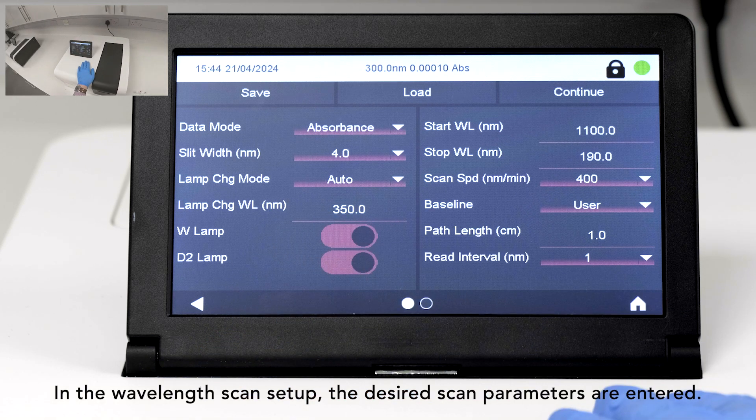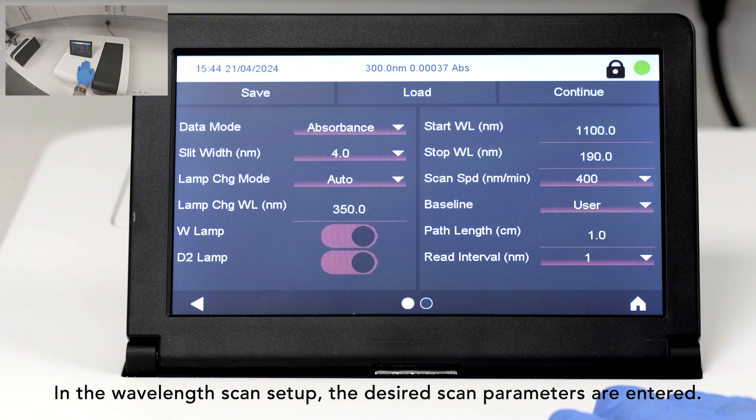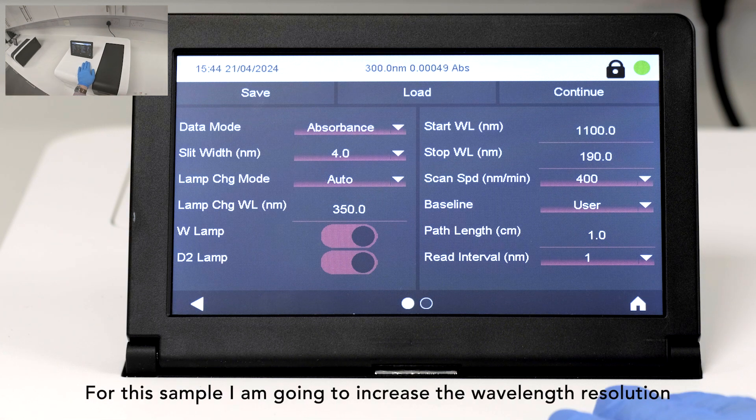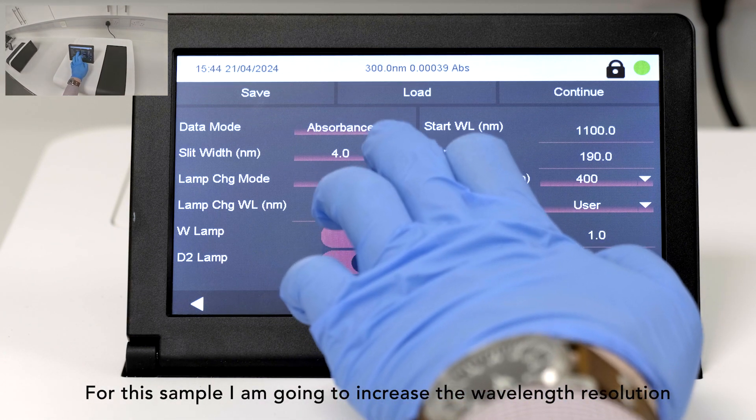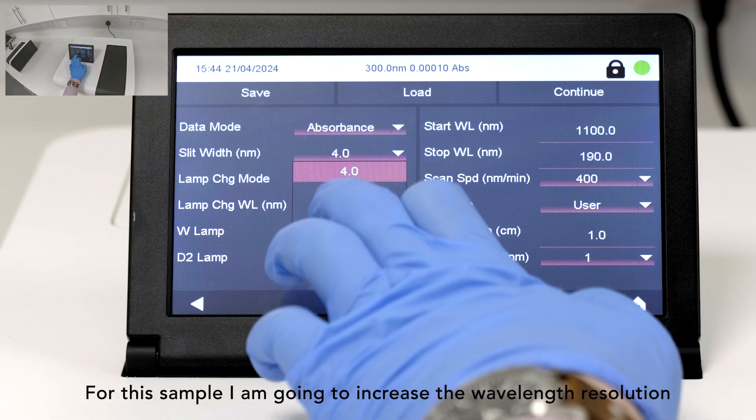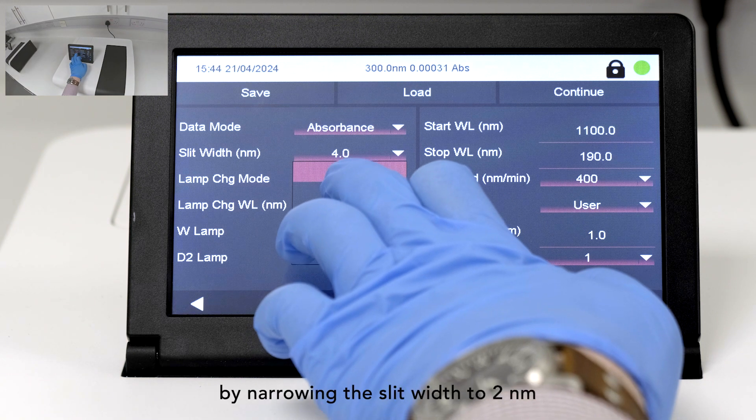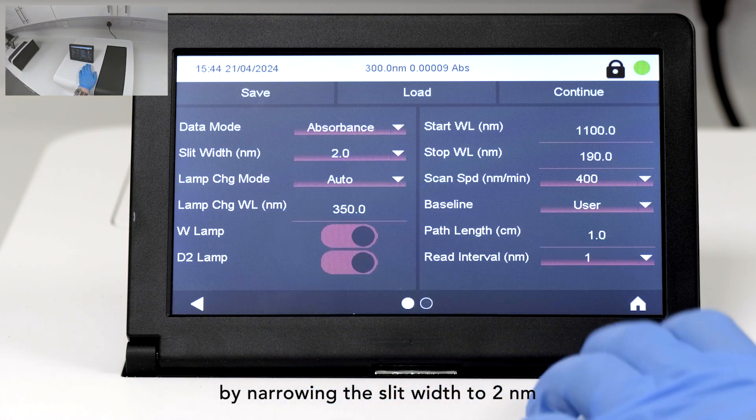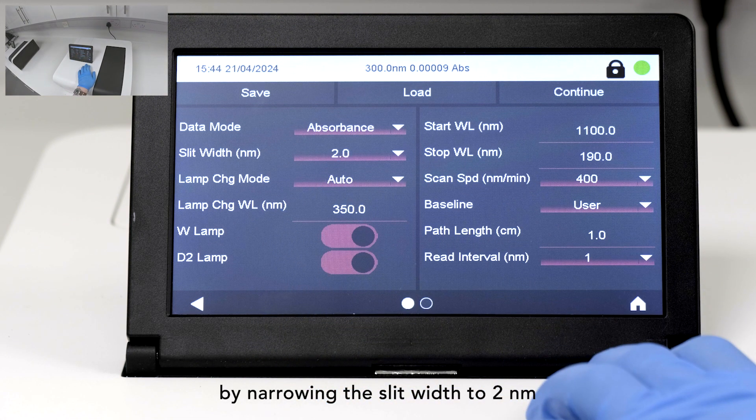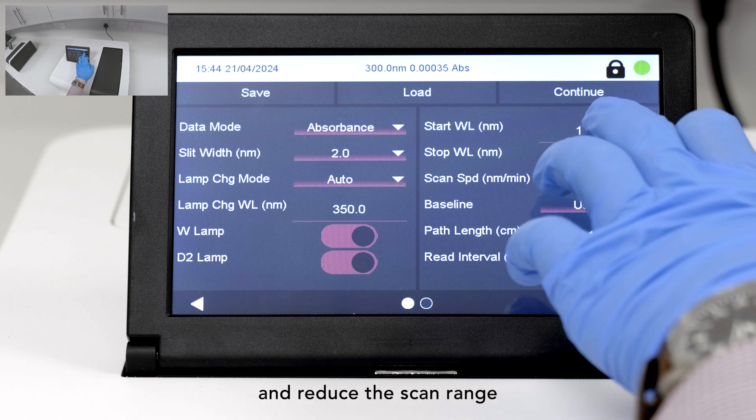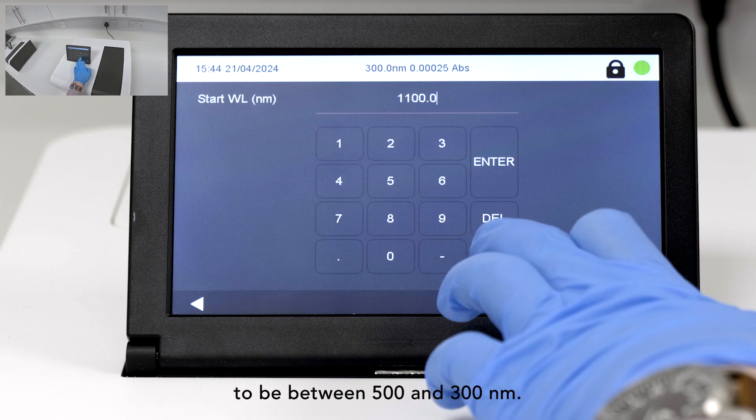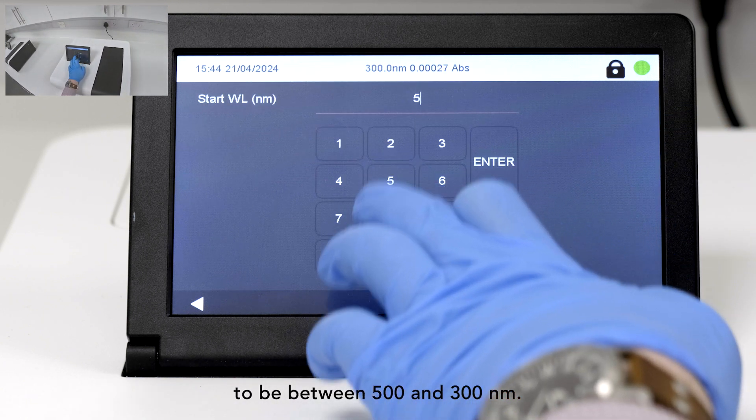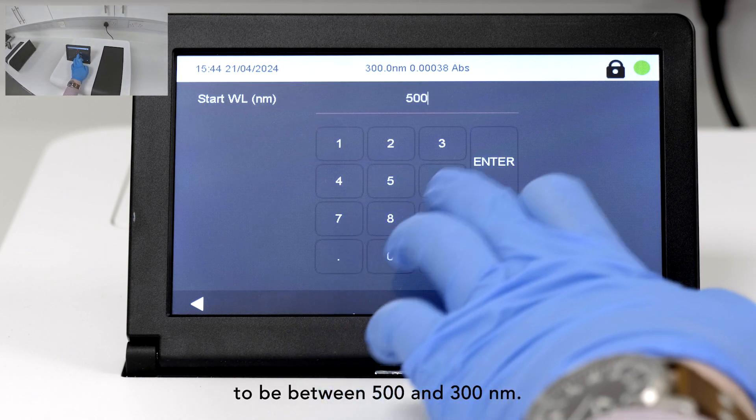In the Wavelength Scan setup, the desired scan parameters are entered. For this sample, I'm going to increase the wavelength resolution by narrowing the slit width to 2 nm and reduce the scan range to be between 500 and 300 nm.